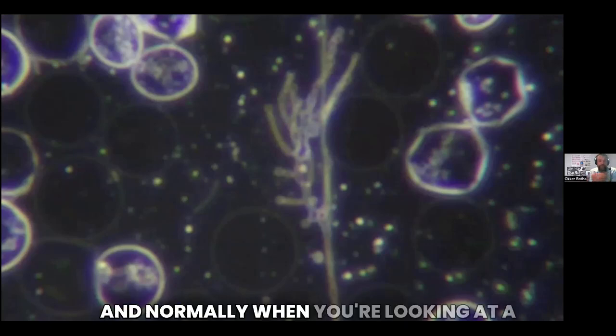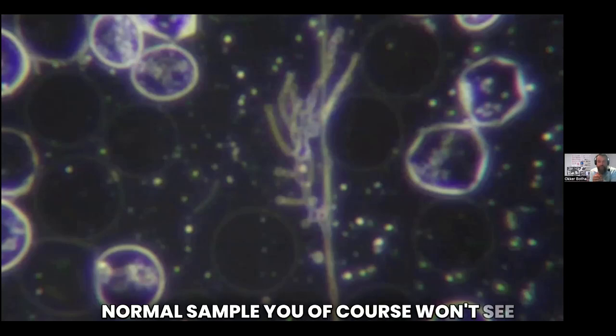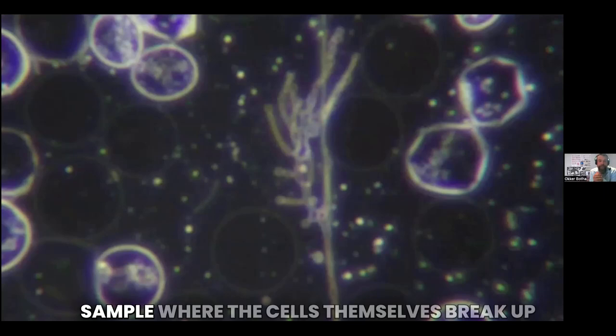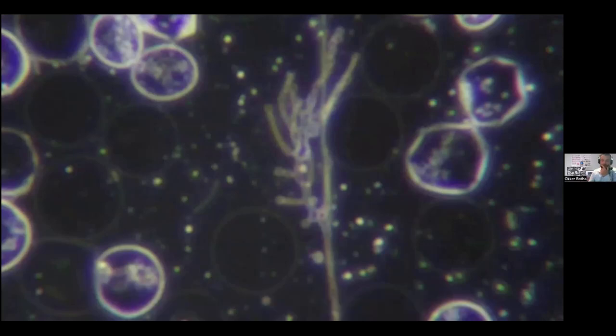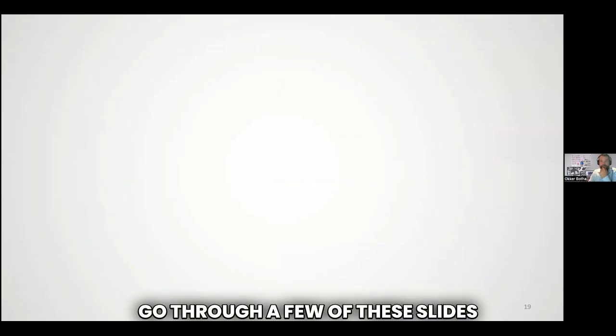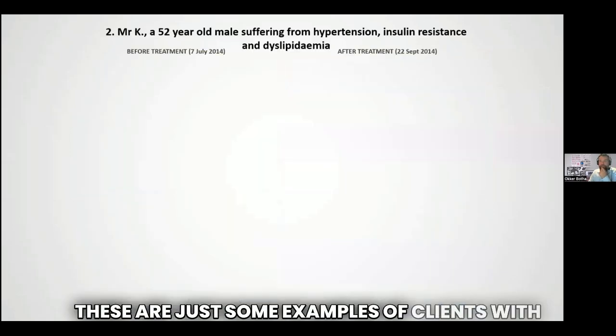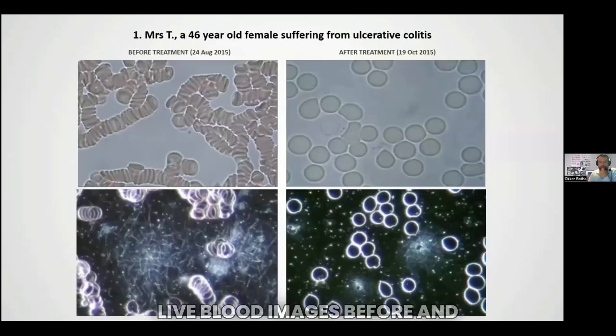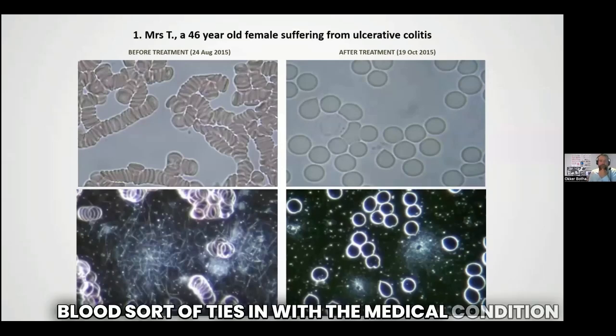And normally, when you're looking at a normal sample, you of course won't see them because they're inside the red cells. Only when the cells themselves break up are we able to see these structures. All right, so let's go through, we do have a few more minutes, so I'll go through a few of these slides. These are just some examples of clients with existing health conditions that we had in practice, live blood images before and after treatment, just to show how the condition of the blood ties in with the medical condition.